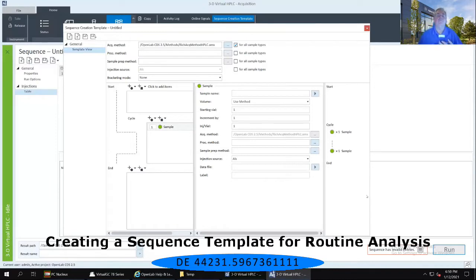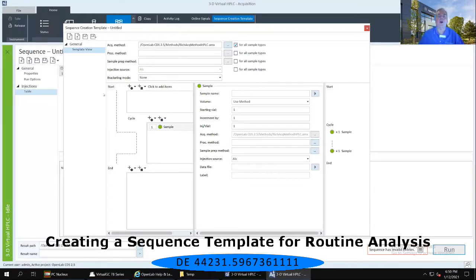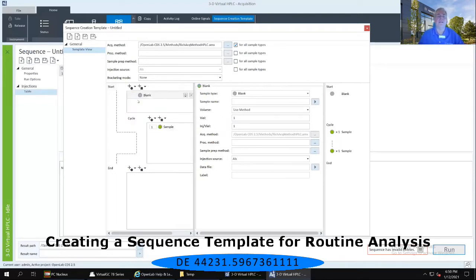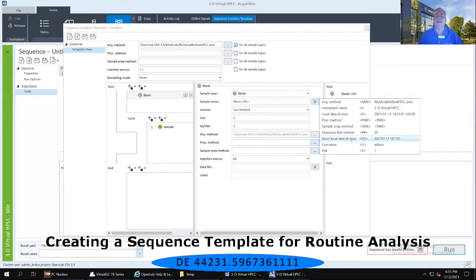The first thing I'm confronted with, according to my SOP, is that each one of my stability sequences has to start with a blank. On the left-hand panel in the lower ribbon, immediately to the right of where it says start, select the very first pull-down menu — there are a series of different sample types, each with its own specific color. I'm going to select blank, which has a gray color. In the middle panel, for my sample name I'll call it 'blank dash', and I'm going to use the right-facing arrow to open up software tokens and use the short local date and time that's automatically going to fill in.